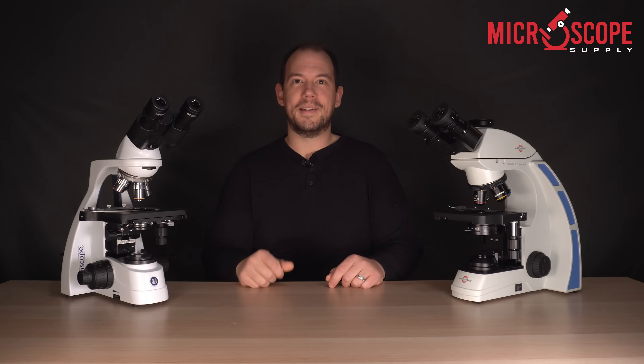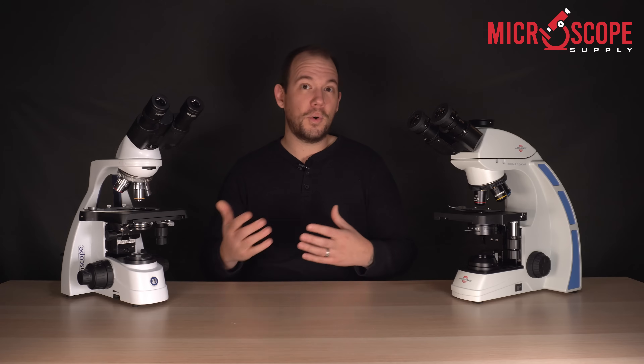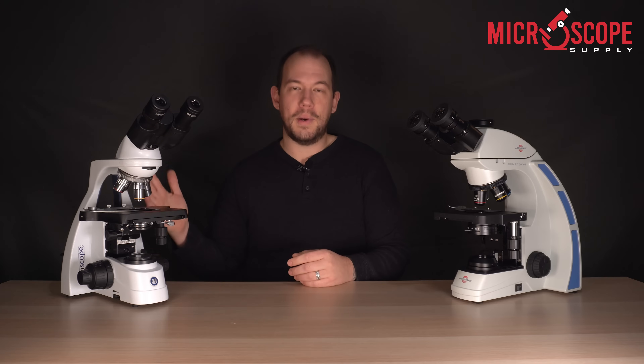The number two thing to consider when purchasing a compound microscope would be the illumination. Traditionally microscopes used halogen bulbs for illumination, but nowadays more and more models use LEDs as the light source. As you know, LEDs can last for over 20,000 hours.